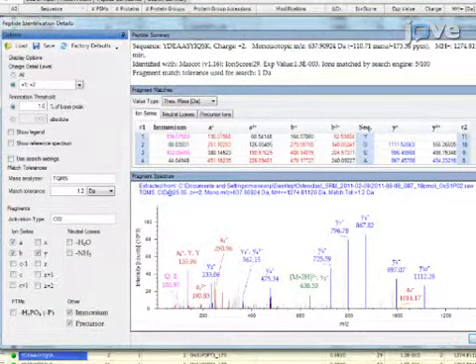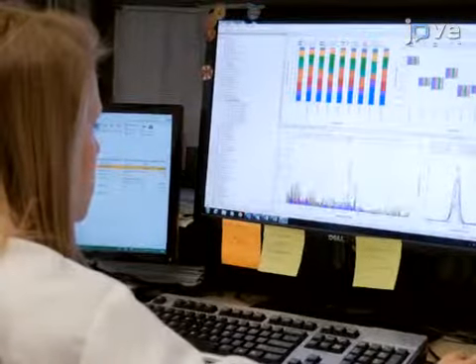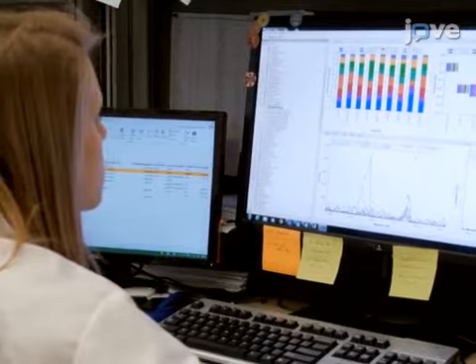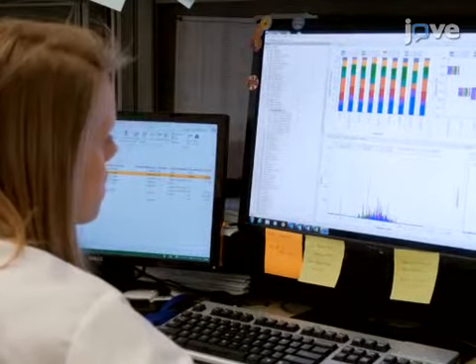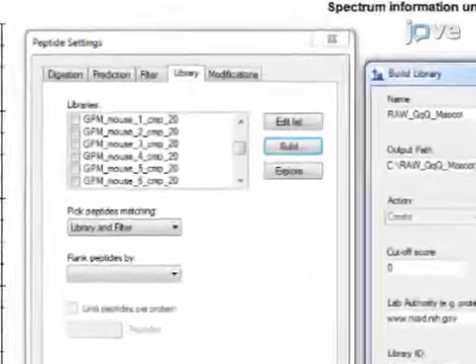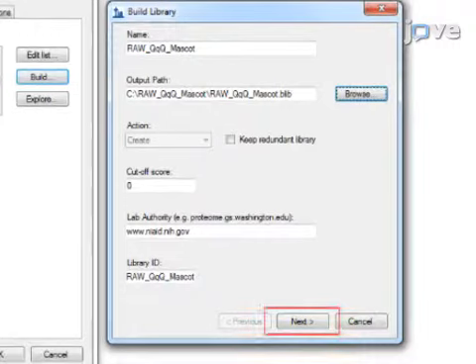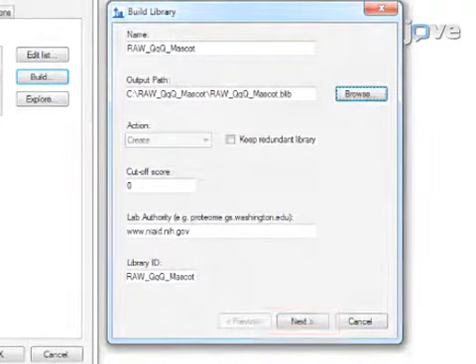Analyze the resulting shotgun data using database searching against the sequences of the external peptide standards. Manually review all of the peptide identifications to ensure that they are all unambiguous, discarding any ambiguous peptide identifications. Use the shotgun MS peptide identifications to construct a spectrum library using a software program such as Skyline.